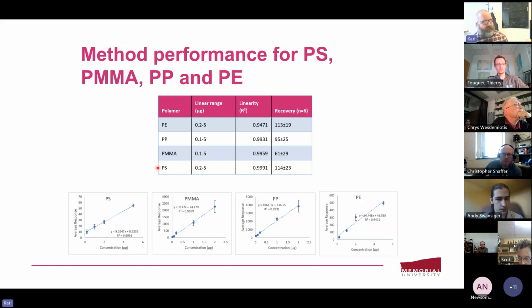For example, polystyrene produces a monomer, dimer, and trimer pretty readily at 500 degrees or so under our experiments. And we monitor the trimer, which is mass 312. That's what most people would do, even with a regular old EI single quad mass spec.